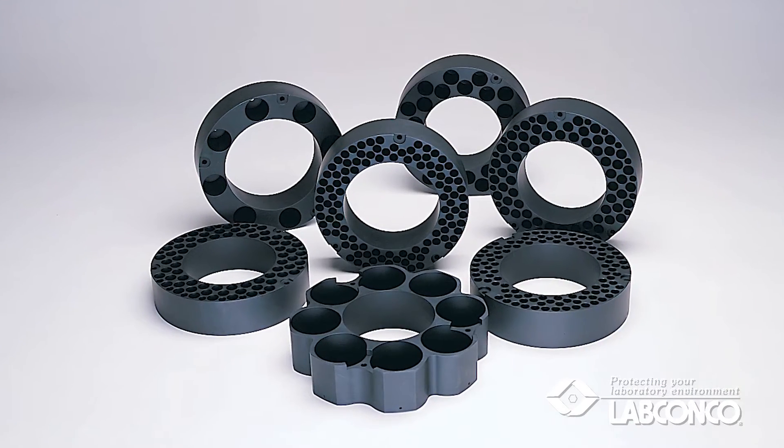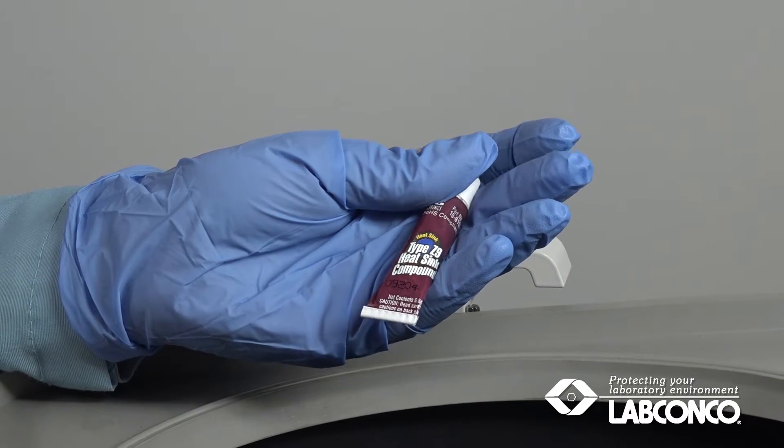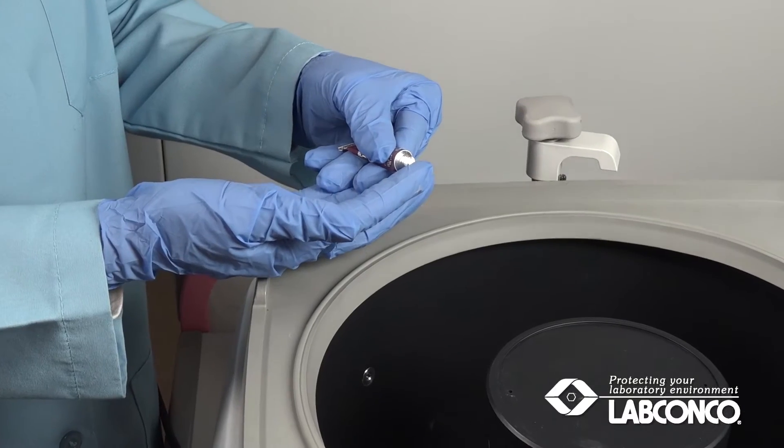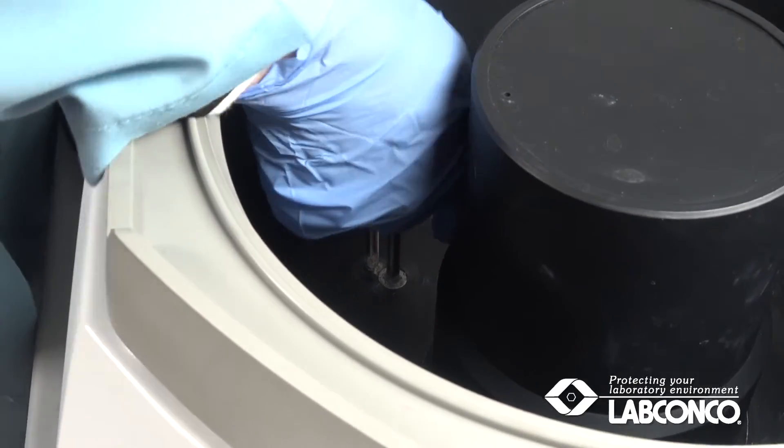Here's how to install a RapidVap concentrator sample block. Apply a small amount of the heat transfer grease supplied with the RapidVap to the end of the temperature sensor probe that extends from the bottom of the chamber.